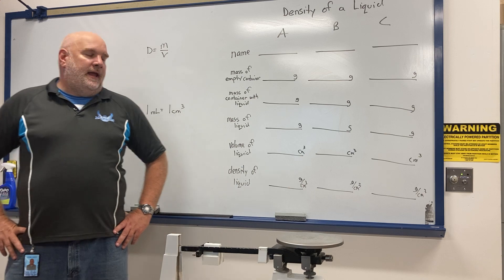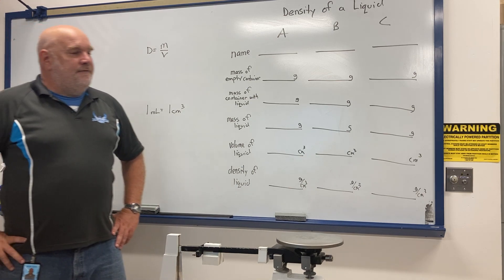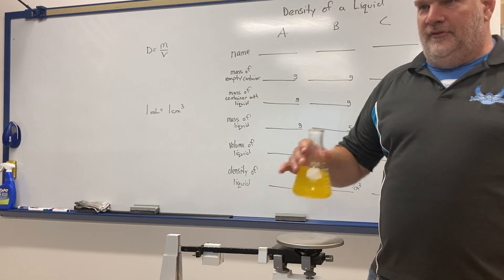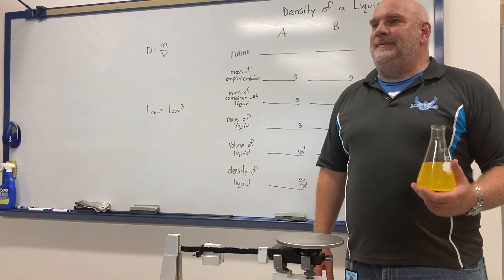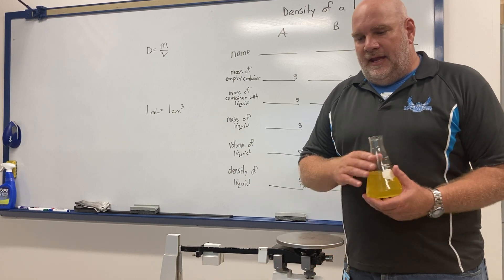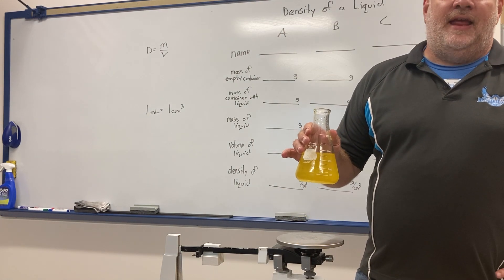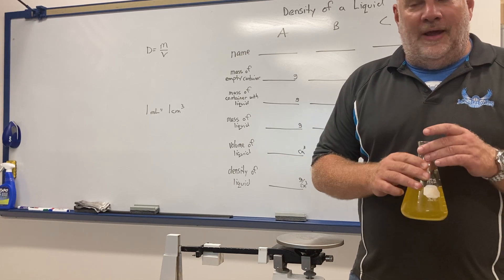To find the mass of a liquid, I can't just pour it on the balance — it'll run all over the place. I need a container to hold the liquid. If I put the container on the balance with the liquid in it, I'm going to get the mass of both the container and the liquid together.